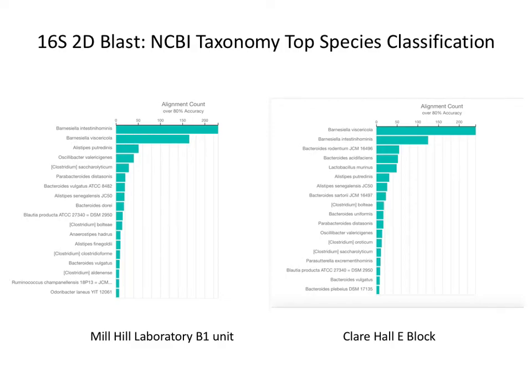Questions? Sorry, I might not have understood. So in your comparison with the short reads, the fragment that was amplified was still the whole 16S? For the short read, it's only V3 and V4, 450 base pair out of the 1500. Why can't the amplification steps be the same? Because you're limited to, as Arnold alluded, you're actually limited. The other way you could do it with short read, if you want to do it cheaper on the Illumina, if you really want to do it cleverly, is you can amplify all the regions and then concatenate them and put it together. For the moment, 450 works with the MiSeq kit because you've got 600 base pairs that you can sequence. So you're basically sequencing those in full.